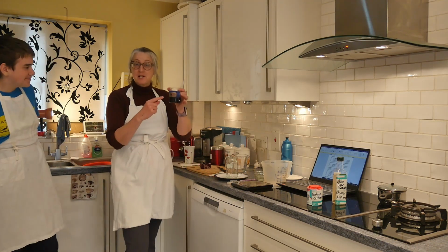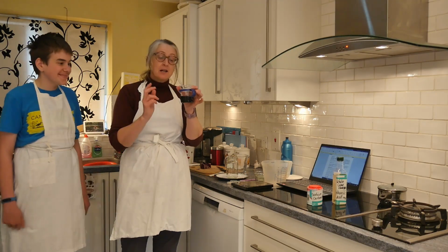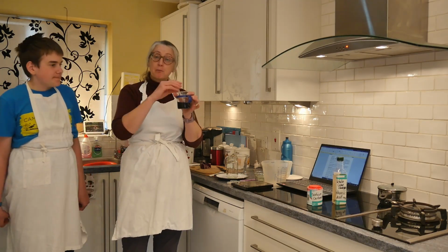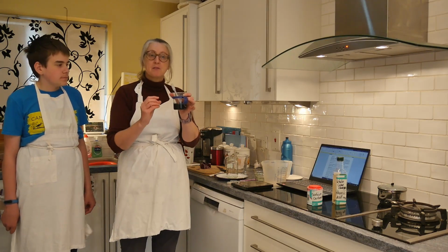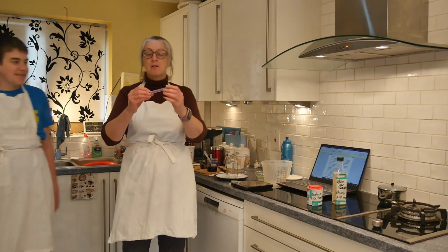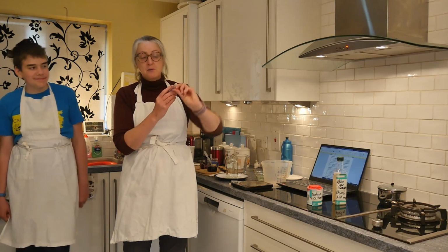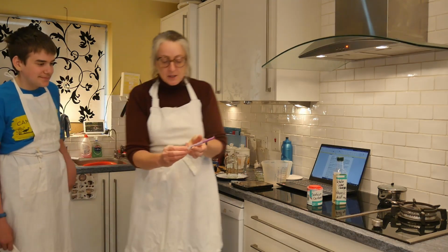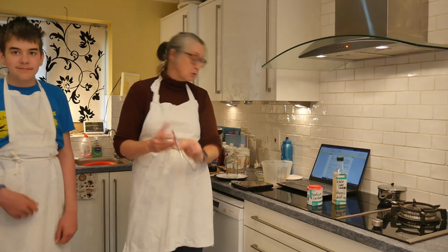Okay, so you're going to need your red cabbage indicator as well. As you can see, we've got one of our pipettes in here. Now, if you've got a science set, you've probably got some of these plastic graduated pipettes in your science set. Do grab some of those if you've got them. If you haven't, you may remember from the last video that we said that syringes, these types of syringes, which are graduated to a small amount, you can find in children's medicine bottles.